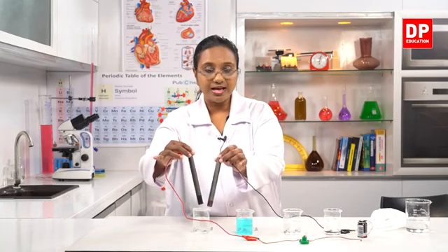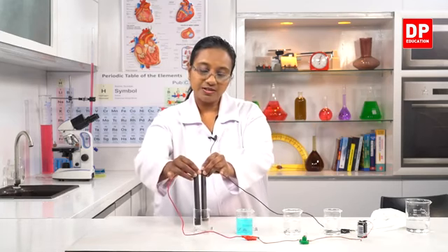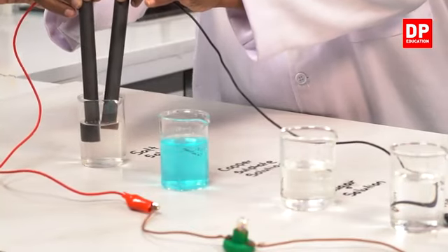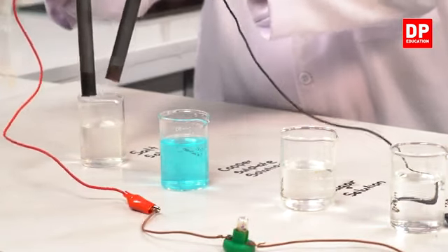You are familiar with that process as well. You have learnt it in grade 9. So that's because of the electrolysis. You can see there the air bubbles evolving at the graphite electrode.